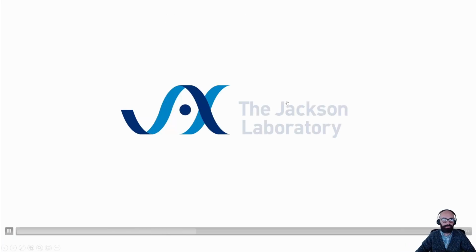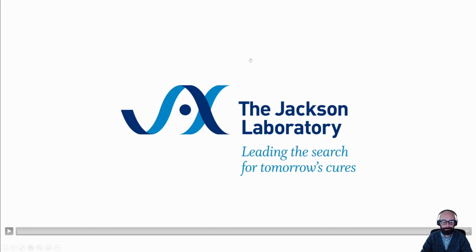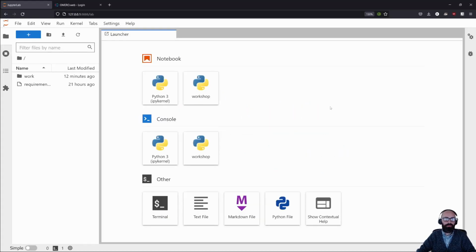This is just a very quick preview of what we are actually talking about in this workshop. Now I will go through some of the main features in a bit more detail. Okay, so before we start the actual workshop, I will go through a very simple example on how to retrieve an image from an OMERO server using OMERO and ezomero just as a warm-up and a point of comparison. This is just a teaser of the things we're going to be doing, just to show that it's real easy to do stuff with the scaffolding that we have built here.